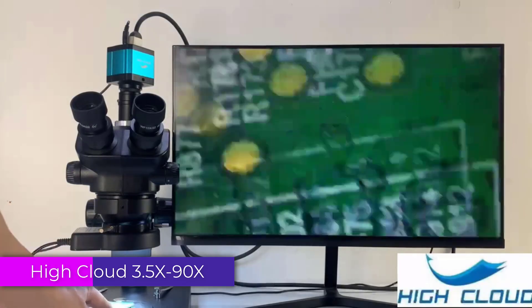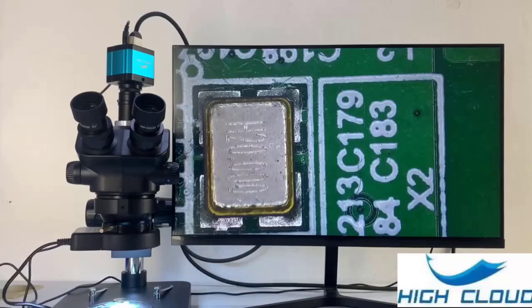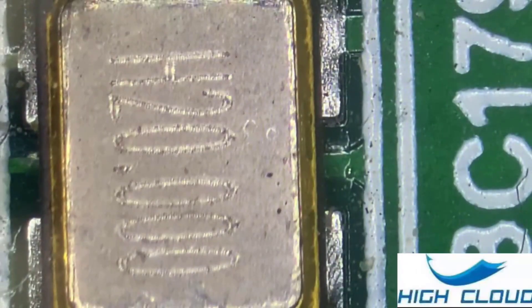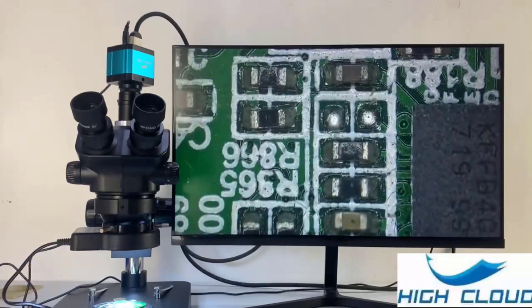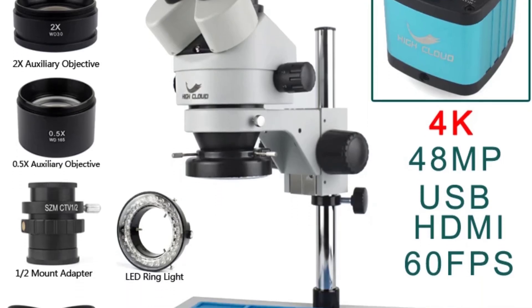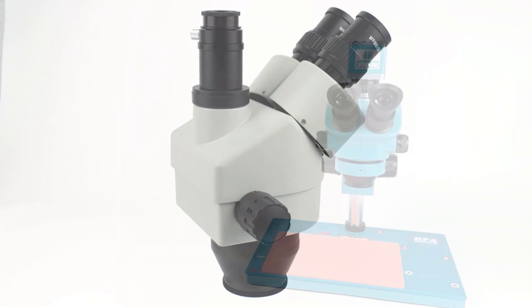Number 4. High Cloud 3.5-200X Stereo Trinocular Microscope. The High Cloud 3.5-200X is a versatile tool designed for precision tasks such as PCB soldering, phone repair, and detailed inspection work. Its impressive range of features makes it a solid choice for both professionals and hobbyists who require a reliable and clear view of their work. With its high-definition optics, sturdy build, and effective illumination, it is an excellent choice for professionals involved in detailed and precision work, providing the clarity and flexibility needed to get the job done efficiently.